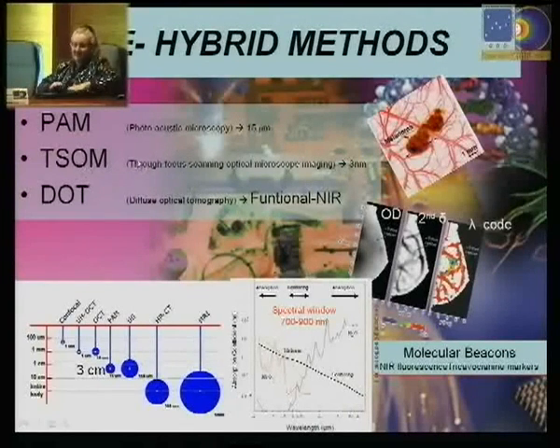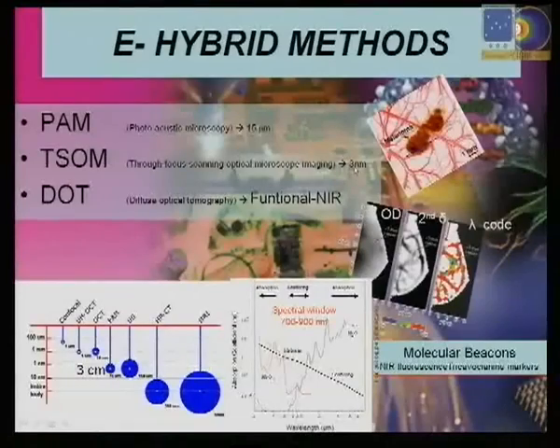The stupid method is that they take several images at different focus, different Z localization, and you make the difference between those images. And this difference will allow you to get 3 nanometer differences.